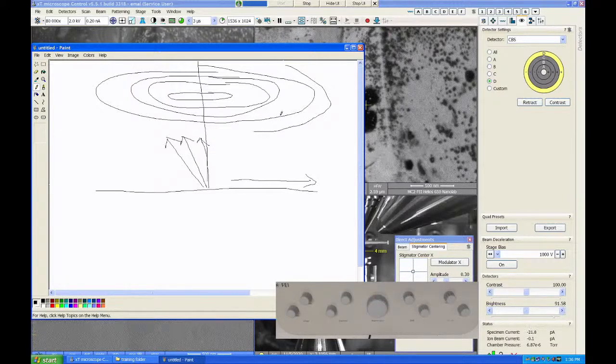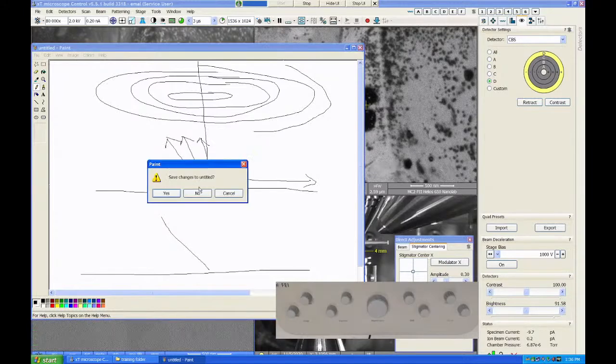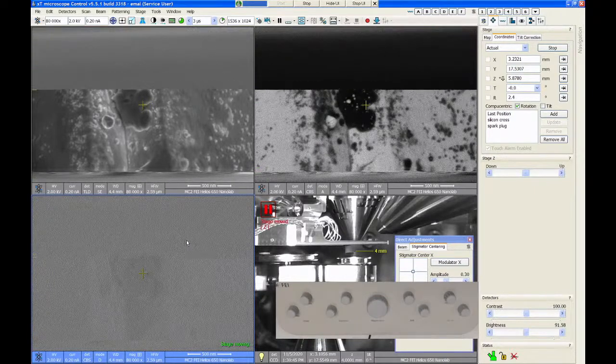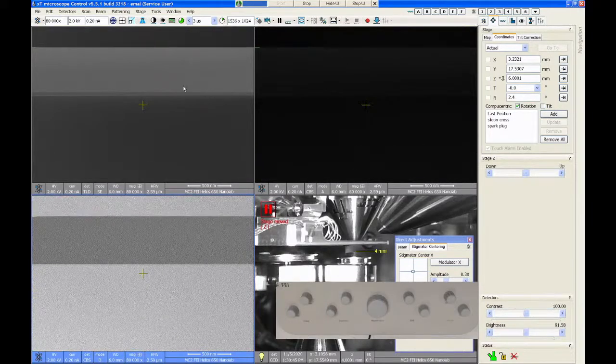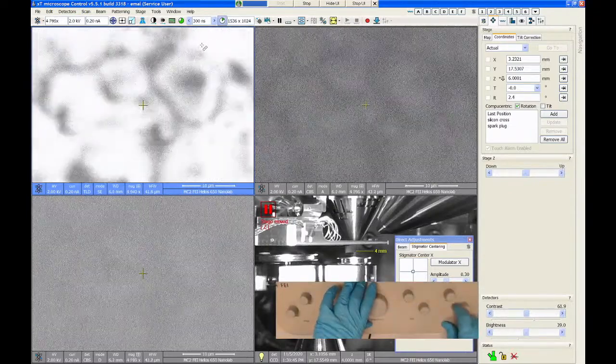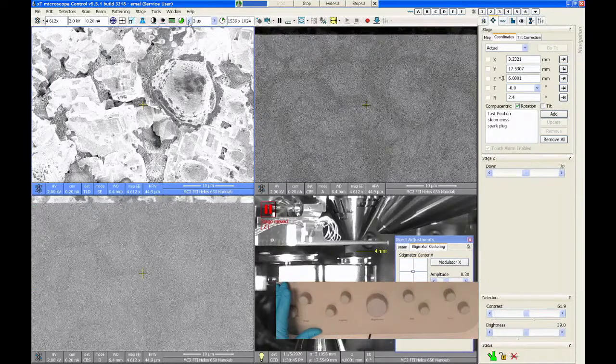It's similar to a high angle dark field detector in TEM. If you go to a really short camera distance, you get really, really good atomic number contrast, but your signal falls off to nothing. So if I want to get more signal on that outer ring, what I can do is drop the sample down a little bit away from that detector, and then that same angle of signal will fall on the D ring. So if instead of imaging at 4 millimeters, I go down to 6 millimeters, we should see more signal on the D ring now. And my focus went way out for some reason. And again, I have to slow down my scan speed.